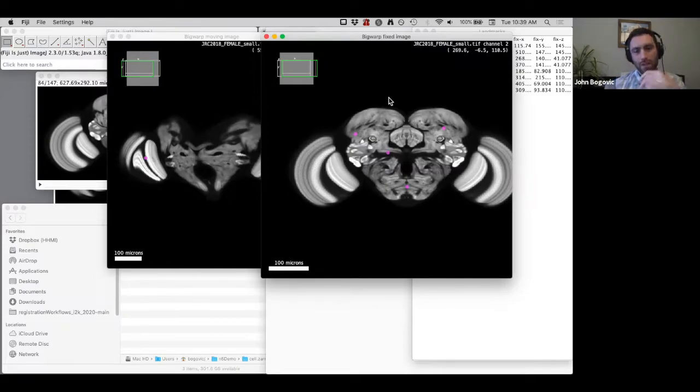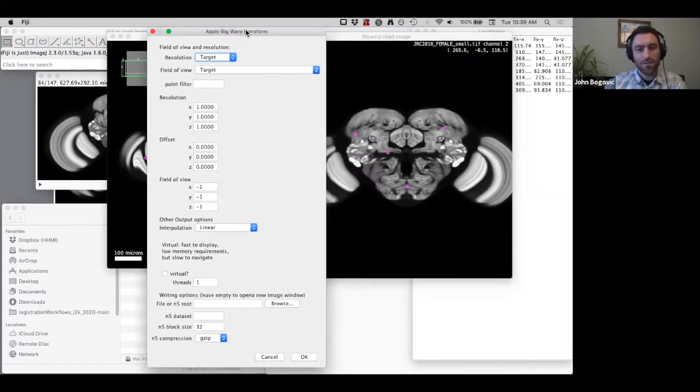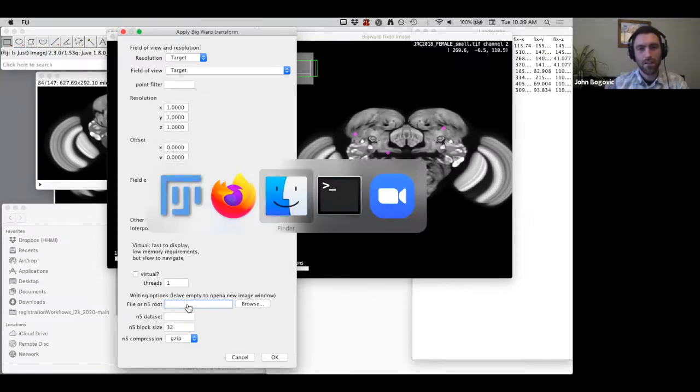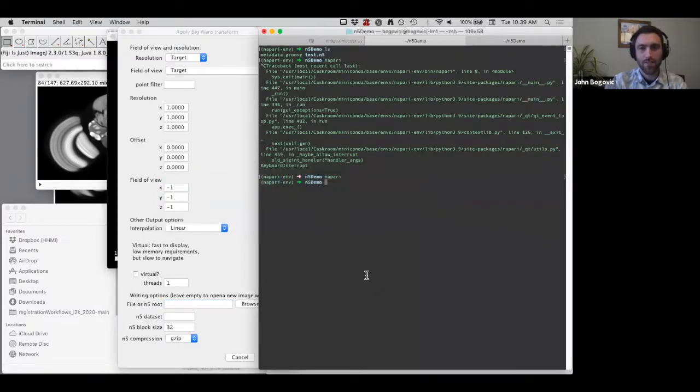And if your image is huge, like that 1 terabyte image of EM, for example, you're not going to be able to do that, because at least I don't have a workstation with a terabyte's worth of memory. But what these formats enable you to do is the processing chunk by chunk, and then write each chunk. And that reduces the memory requirements significantly.